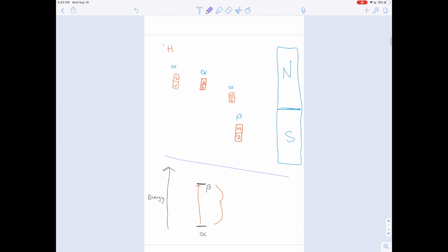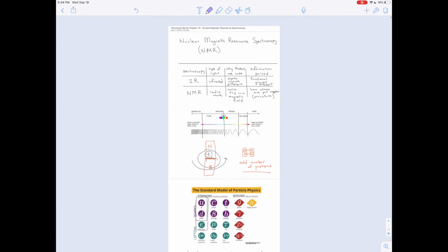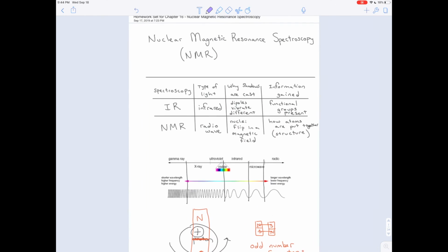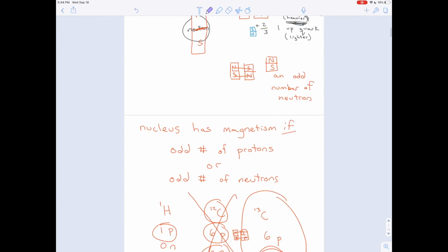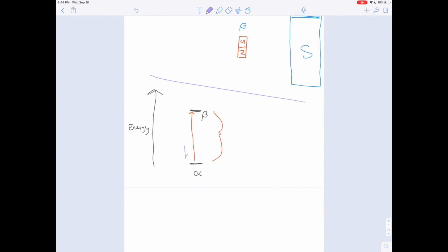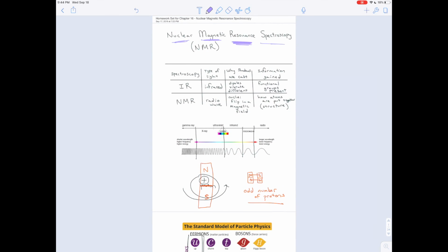electrons. So far in our discussion, we've just talked about the nuclei. And actually, we've gone far enough in the discussion that we can appreciate the name of this technique, nuclear magnetic resonance spectroscopy. The nuclei are like little magnets, and we're shining light on them until the energy of the light is in resonance, the same amount of energy as the difference between the two states. When the light you shine has the same energy, it's said to be in resonance with the energy difference, and so the nuclei flip, and we get our shadows. Spectroscopy.